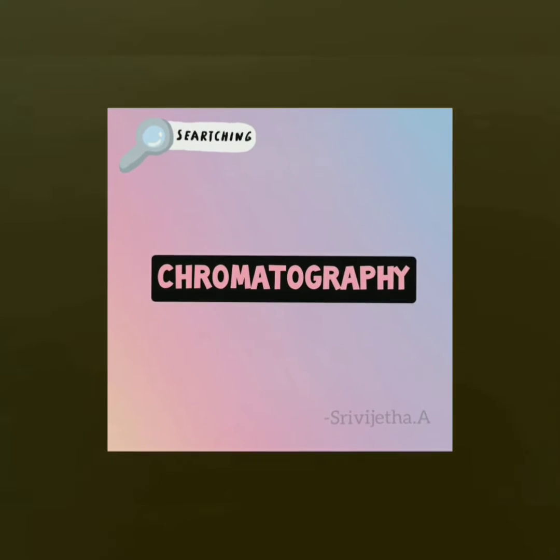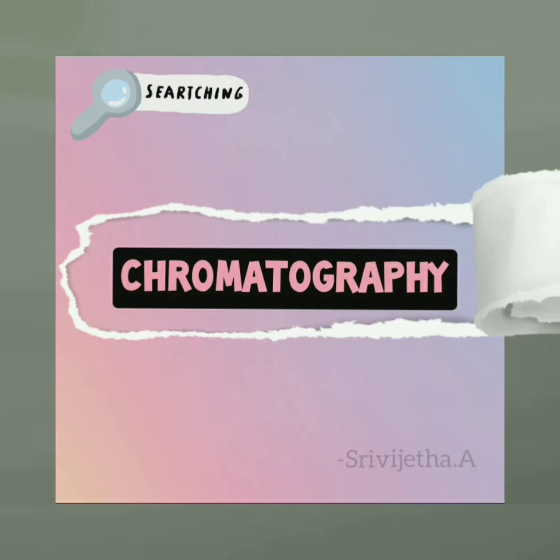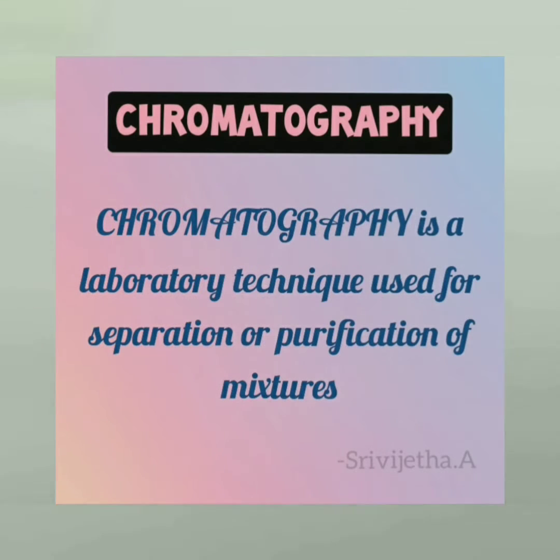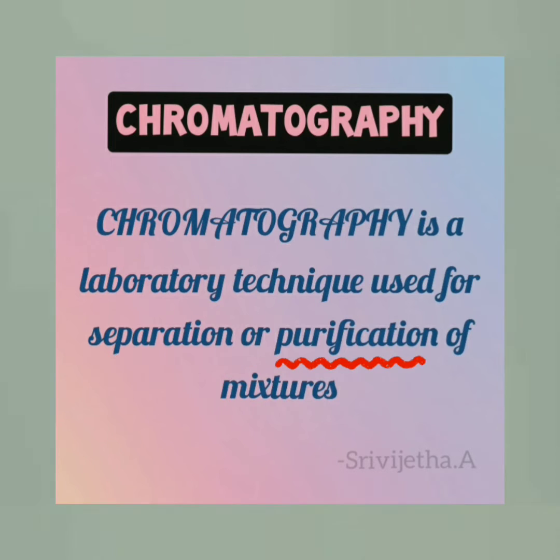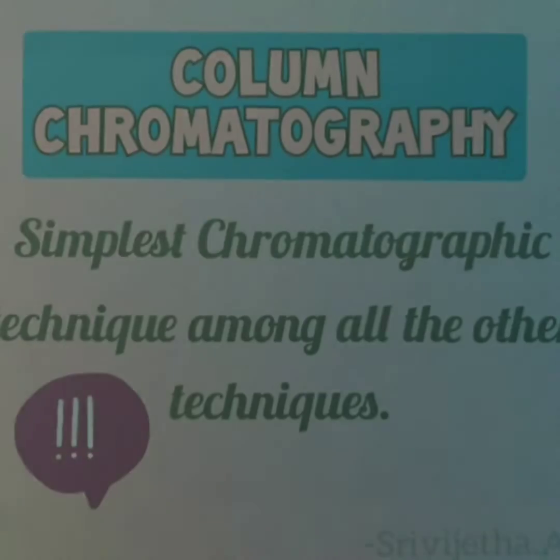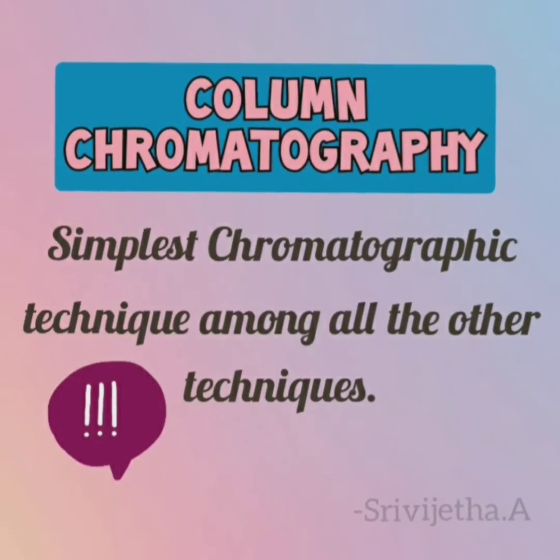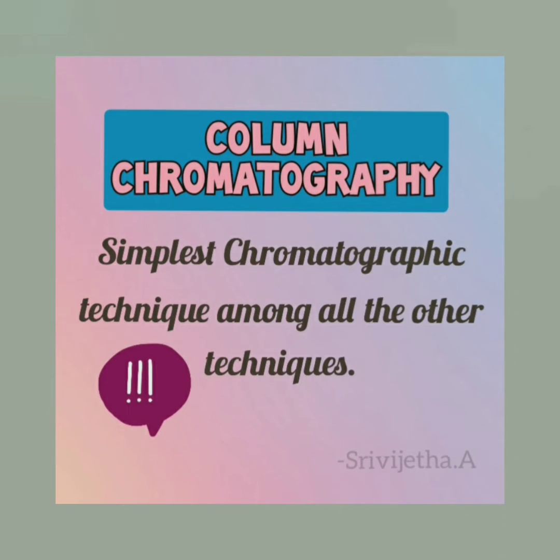Before starting, let me give you a one-line definition of chromatography. Chromatography is a laboratory technique that is used in the separation or purification of a mixture. So, coming to the topic, column chromatography. It is the simplest chromatographic technique used to separate and purify mixtures. Overall, there are many chromatographic techniques, but compared to everything, column chromatography is the simplest technique.